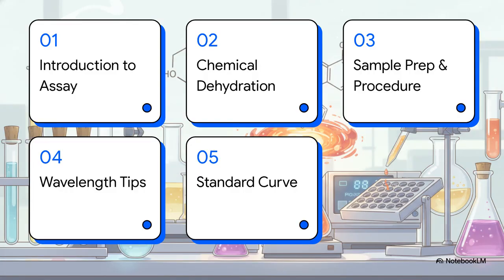Okay, here's our game plan for today. We'll start with an introduction to the assay, then break down the chemical dehydration process, cover sample prep and procedure, go over some pro-wavelength tips, and finally, wrap it all up by plotting that standard curve.